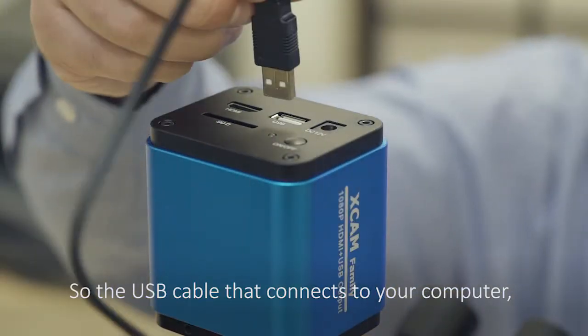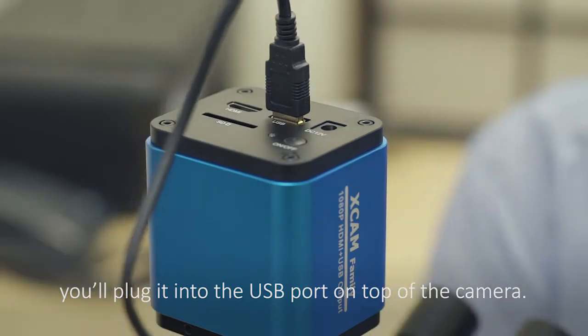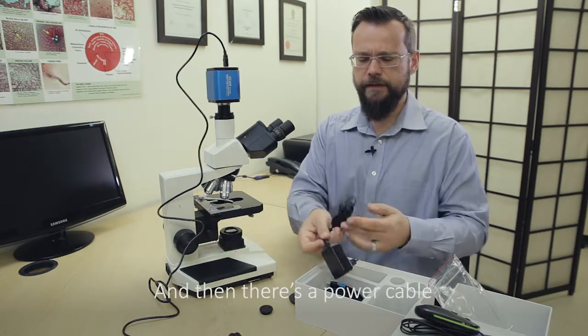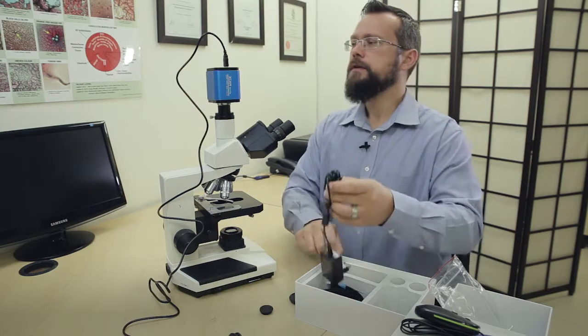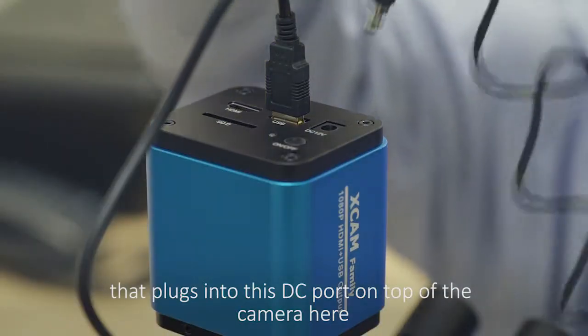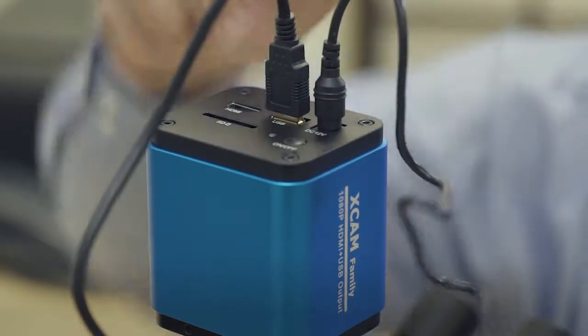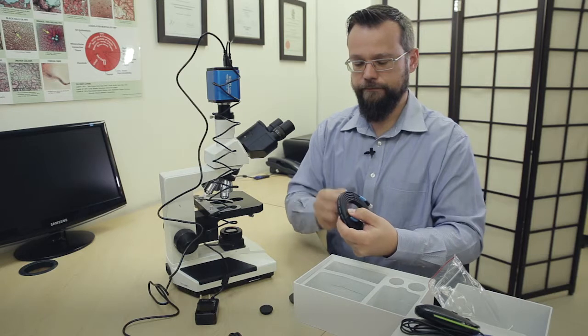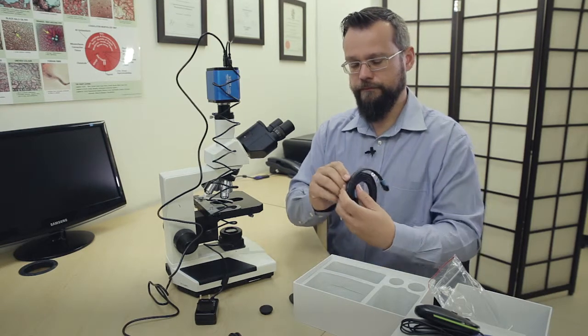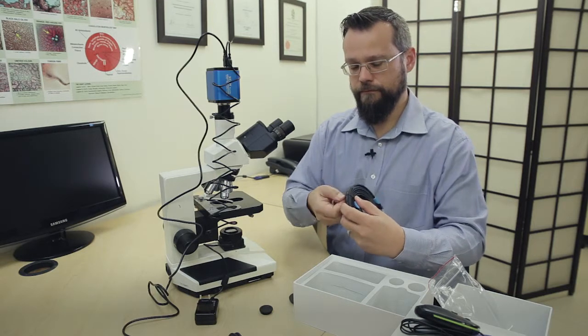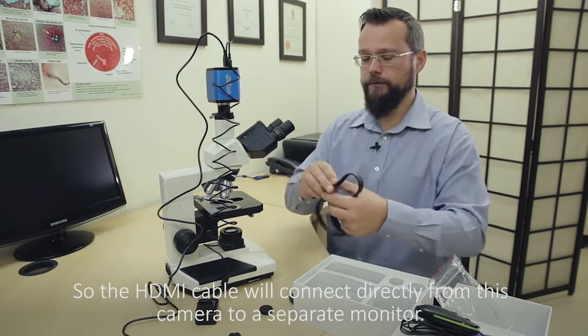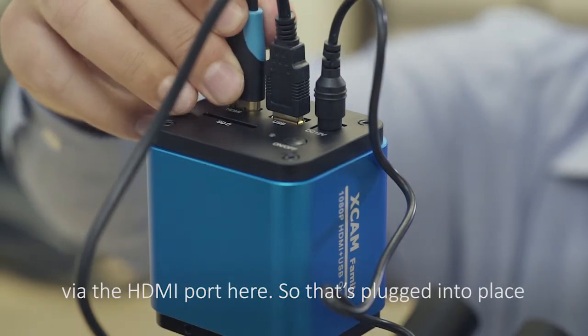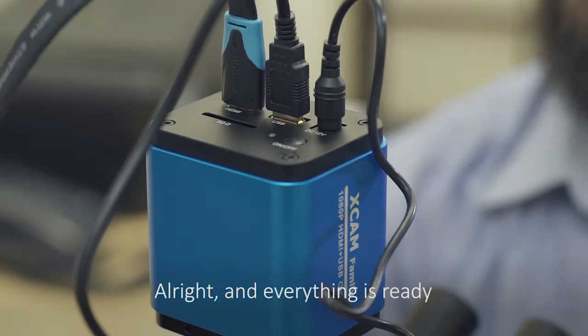So you have a USB cable that connects to your computer, so we plug it into the USB port at the top of the camera and the other end will plug into the USB port on your computer. Then there's a power cable that plugs into this DC port on the top of the camera here, and then your HDMI cable. So the HDMI cable will connect directly from this camera to a separate monitor via the HDMI port here, so that's plugged into place. All right and everything is ready.